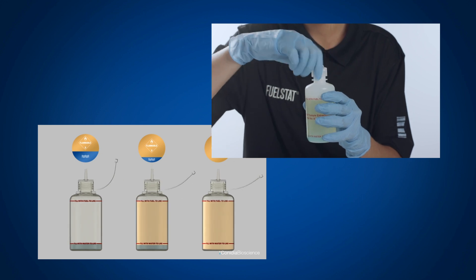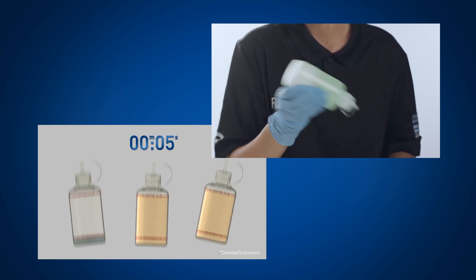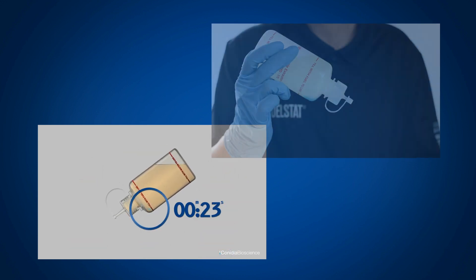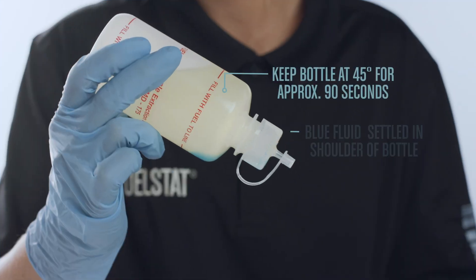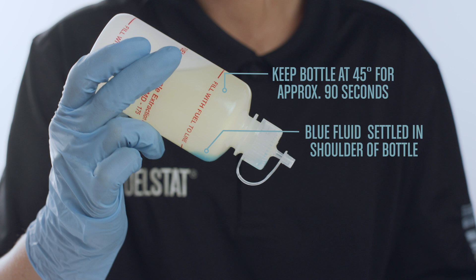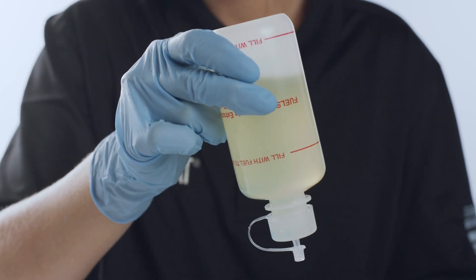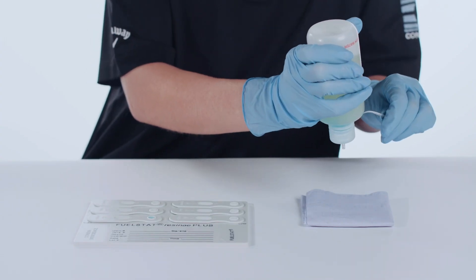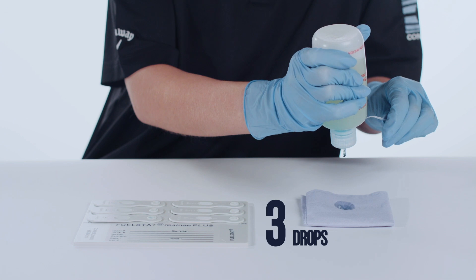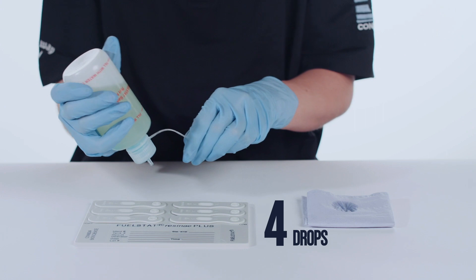Now tighten the dropper cap onto the test bottle and shake for 5 seconds. Invert the test bottle 45 degrees for approximately 90 seconds to allow the blue fluid to settle out in the shoulder of the bottle. Please note that for a free water phase only test, the blue fluid will not separate out. Now fully invert the bottle and keep it inverted at all times. To ensure that no fuel is trapped in the nozzle, place 4 drops onto a tissue to help ensure that only the blue liquid is transferred onto the FuelStat test plate.